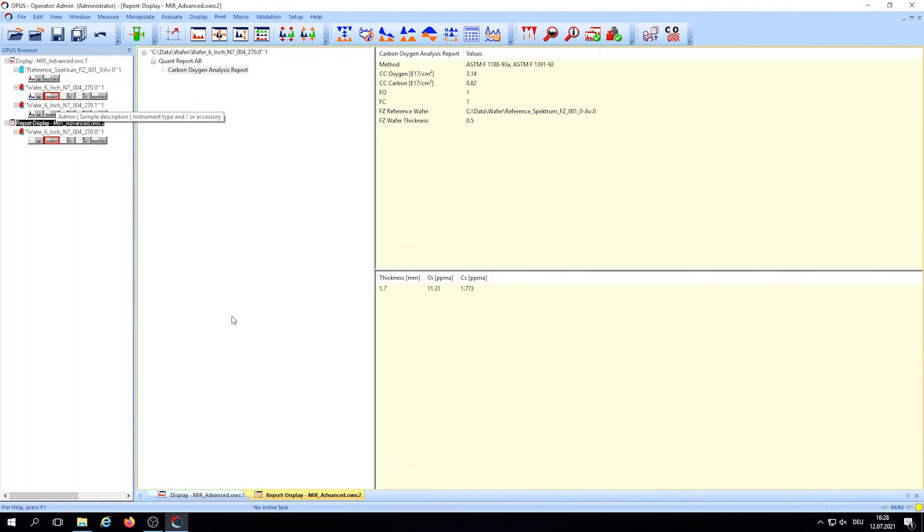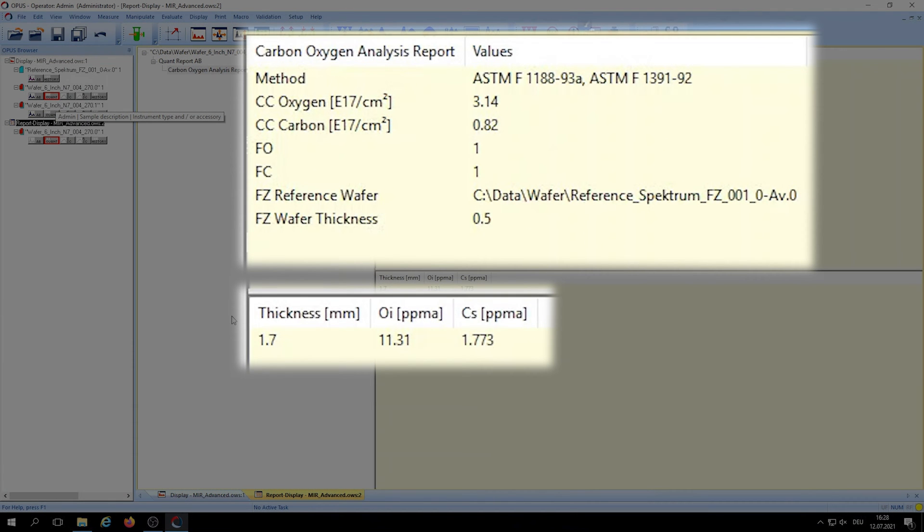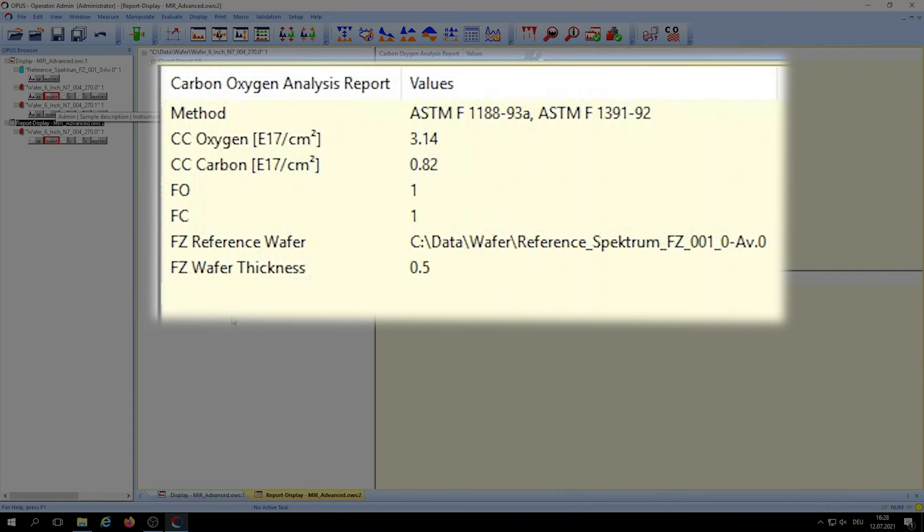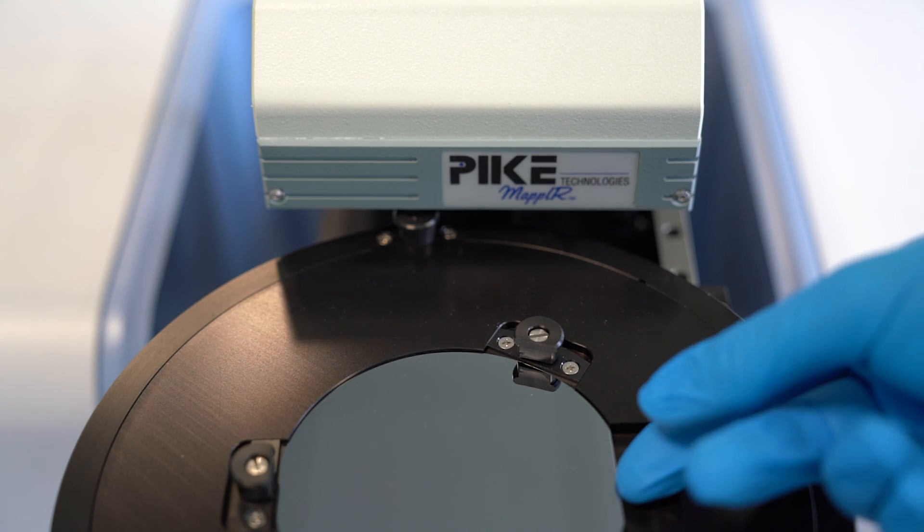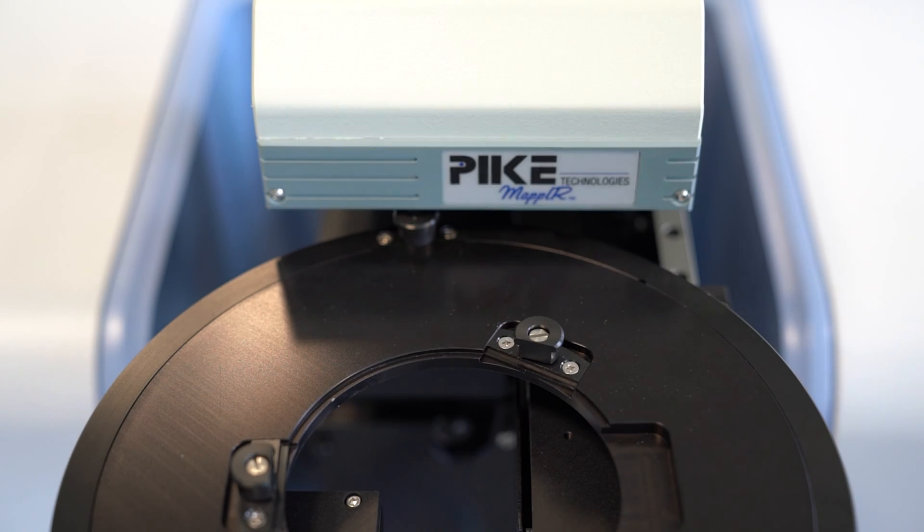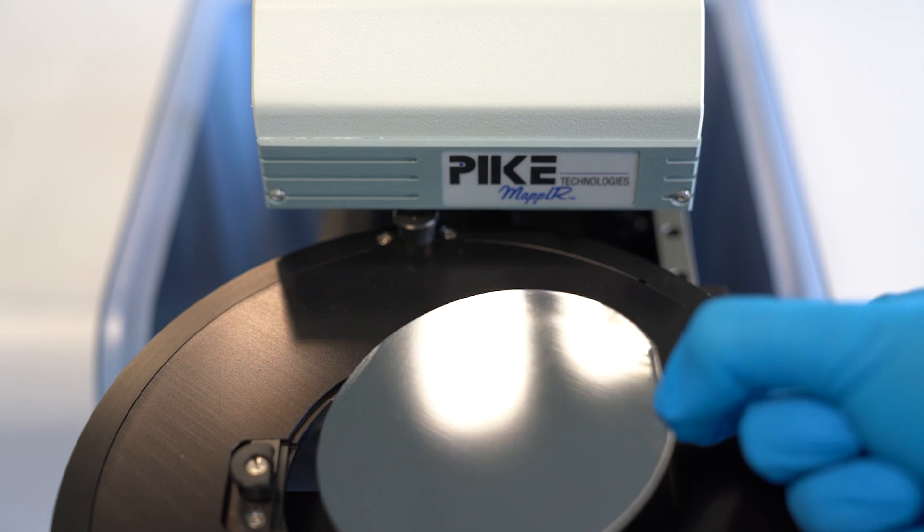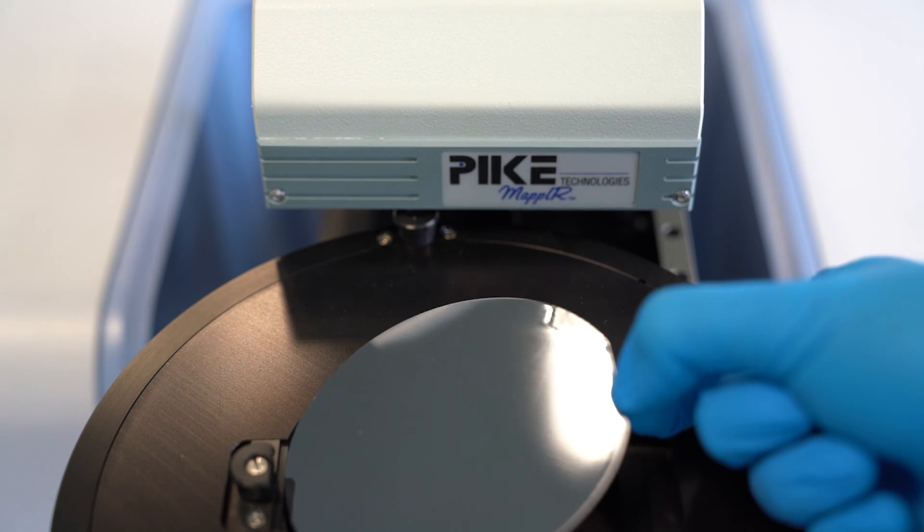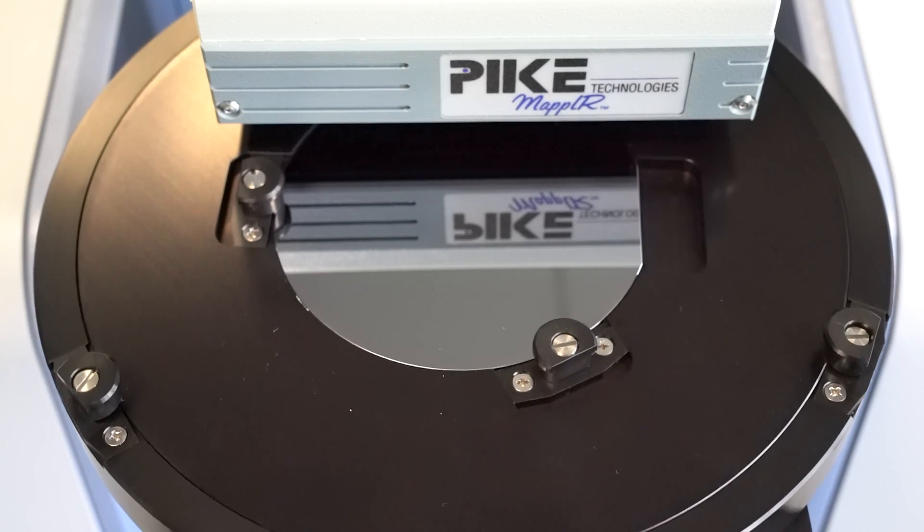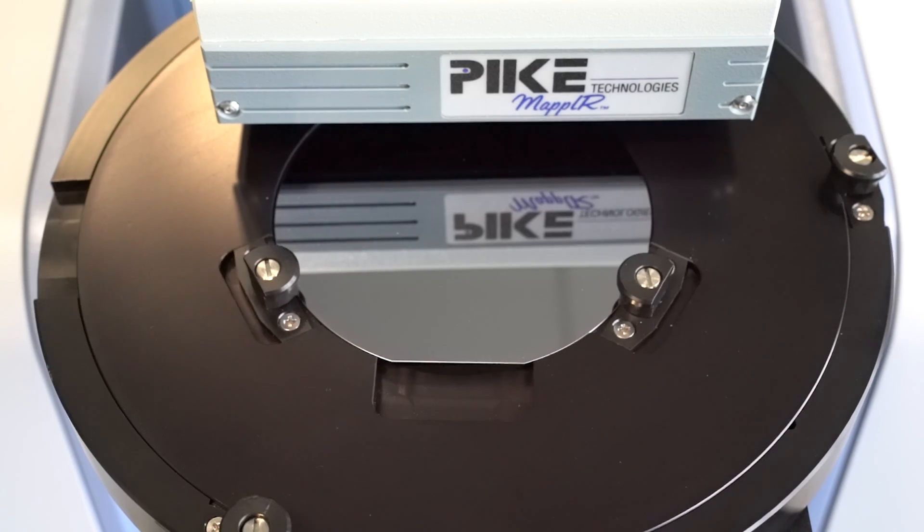When the analysis is done, OPUS will give us a nice display of the results. It looks like this wafer has a carbon oxygen content that's within the specification. Now we went through the measurement and evaluation of this one wafer, but most of the time it's more efficient to measure many wafers back to back and do all the evaluation at once later.